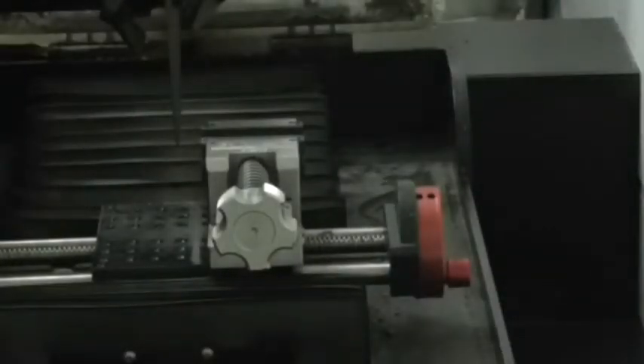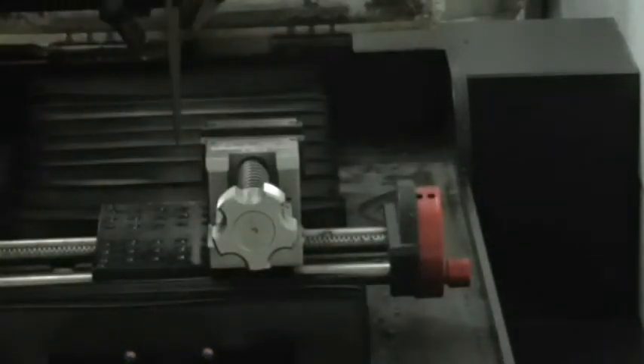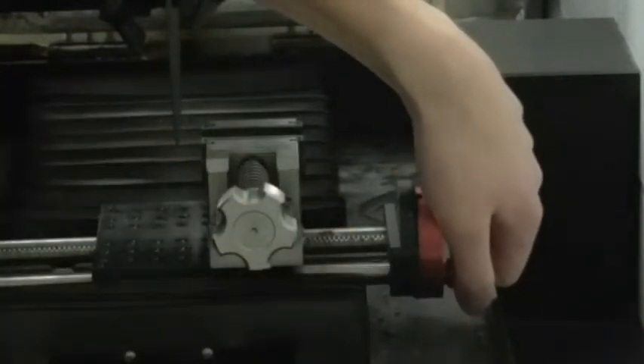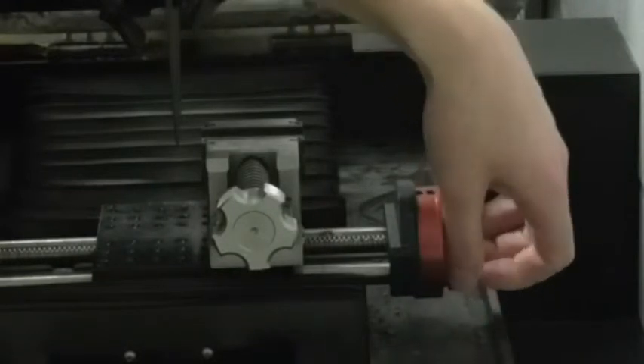This is the table we place the specimens in to be sectioned. What we're going to do is place the specimen in this table. But first, I'm going to show you how to adjust the table so that it can fit to the specimen's measurements.